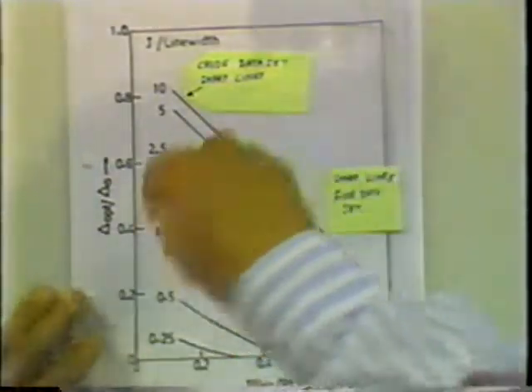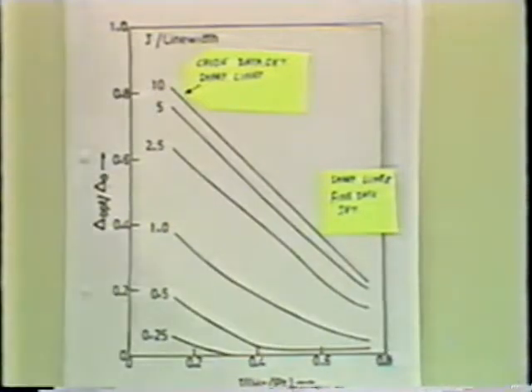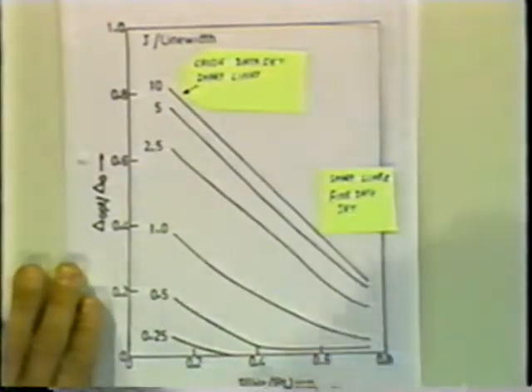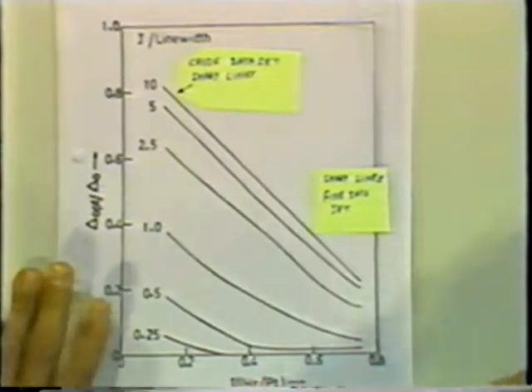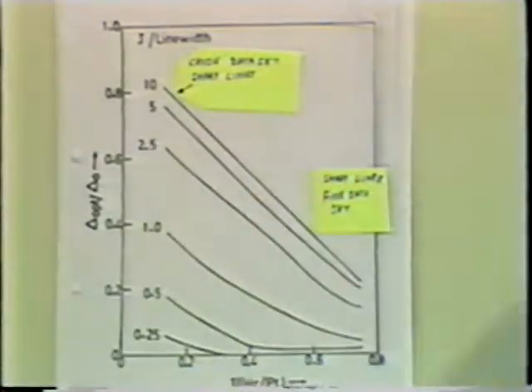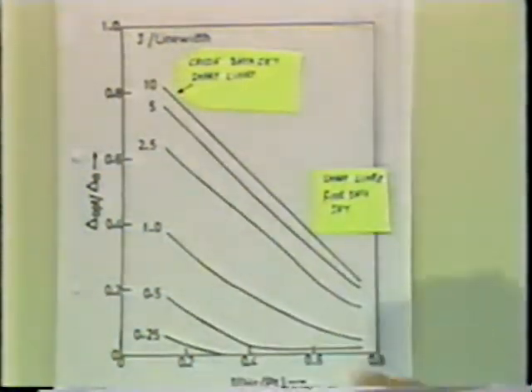And so these curves also tell us what we should do in T2 dimension, because there we increase this hertz per point quite a bit, and then we need a smaller delay in T2. So often the optimum experiment is one in which you have a slightly larger delay in T1 and slightly smaller delay in T2.